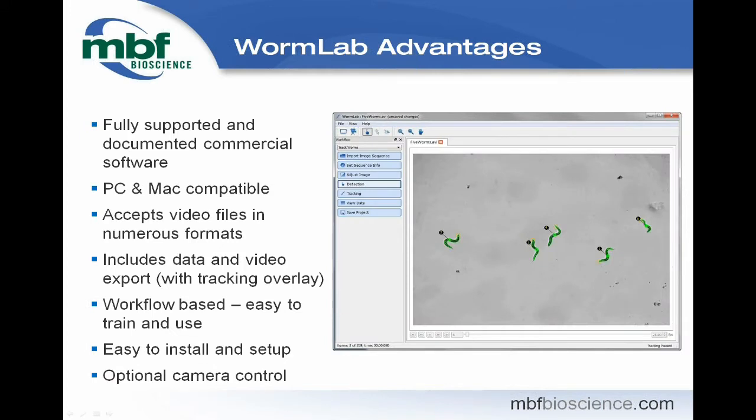One of the goals with Wormlab, something that we tried to do, was to deliver a product. This is a commercial product which would have a long-term product life cycle. So we delivered the product about a month and a half ago, 2 months ago in March, and we see a product life cycle that can run 10 or 20 years, similar to our other products. So the advantage of that is that by using Wormlab, you get continued support over a long period of time. So as people come into your lab and leave your lab, you have a consistent analytical method and a product that's been designed to be easy to learn and easy to set up so that you don't have to gather multiple components from different sources, but that you have something you can quickly install and run on a Mac or on a PC.